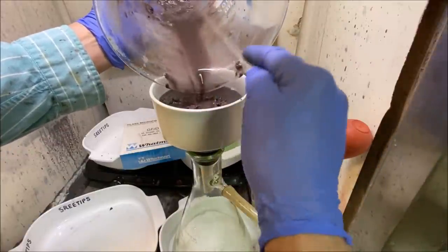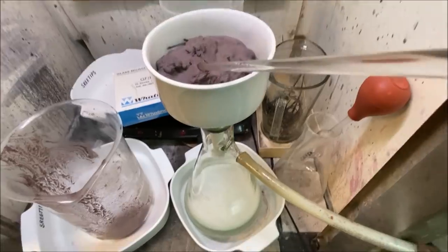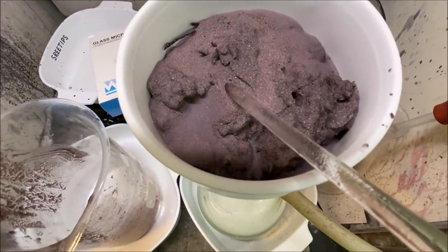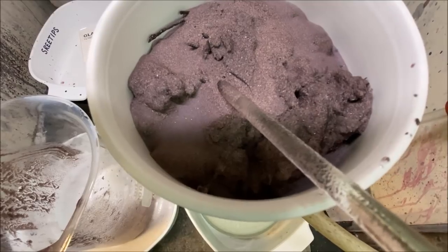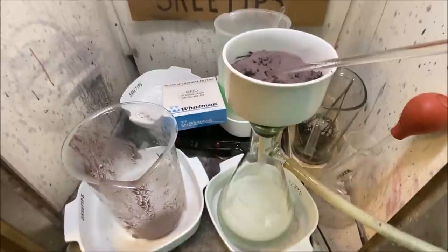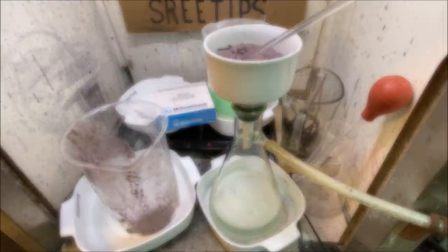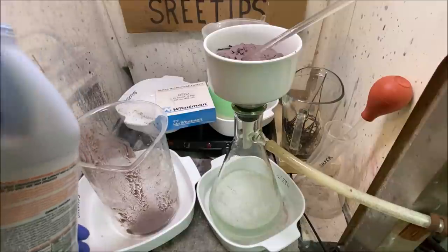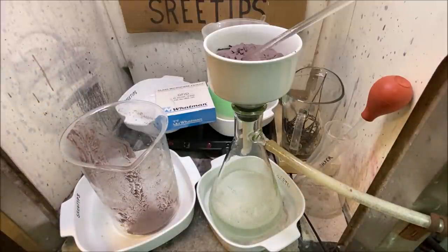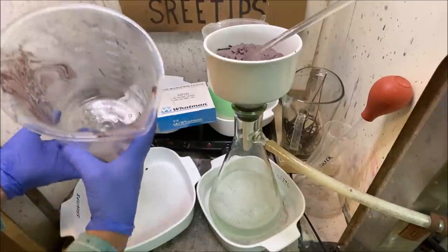Sulfuric acid — don't you just love it. You can see it's pulling some foam through. The material up in the funnel is probably going to be copper sulfate mixed in with some silver sulfate — I have no idea how to separate that. I'm not going to worry about the solids; I'm going to concentrate on getting the silver out of the solution in the bottom of the flask. I'll do one more rinse with sulfuric acid to rinse as much of the silver-bearing solution as I can out of the material in the funnel.